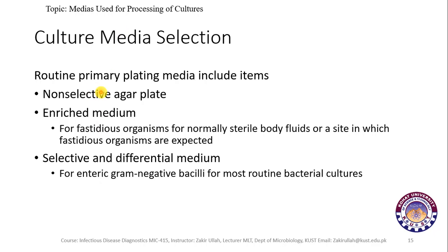The culture media selection includes different terms and different items for routine culturing. The first of them is the non-selective agar: when a sample comes to the lab and is received, during inoculation it is primarily inoculated on non-selective media.